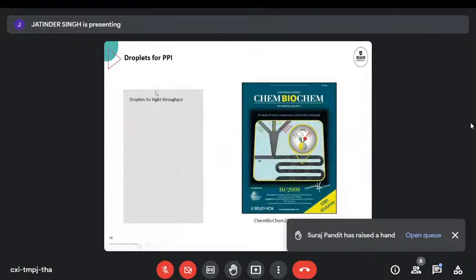To look at things with more throughput, we can use droplets where we use an aqueous solution that's interdispersed in an oil-based environment. We can use them as discrete reaction containers. We've seen that as PCR, that's when we had all the PCR reagents in one of these droplets and we did inject our target DNA, we got amplification. If we did not inject our target in these droplets, we did not get amplification. And by then counting the number of droplets that had fluorescence versus the ones that didn't, we could quantify the amount of DNA that was present in our overall solution.